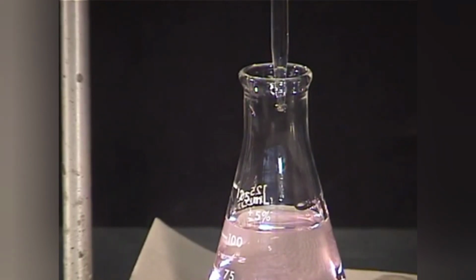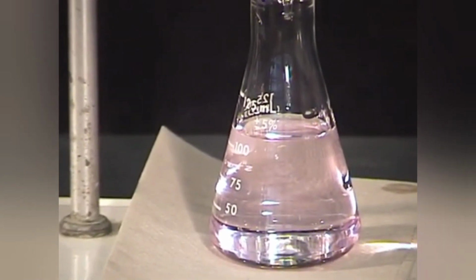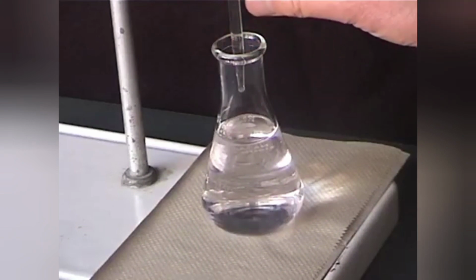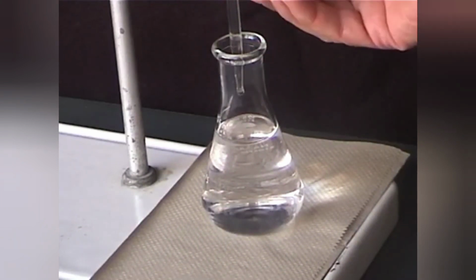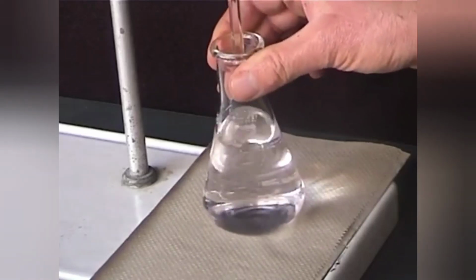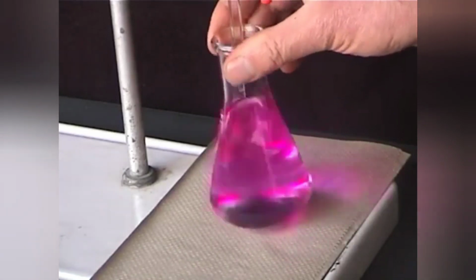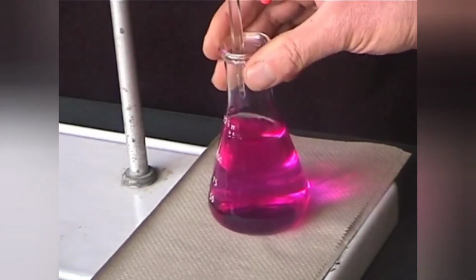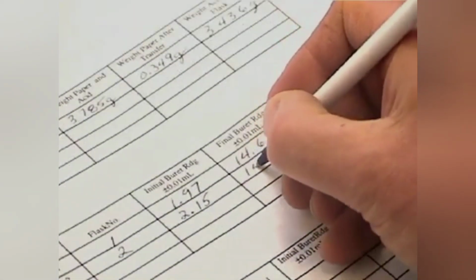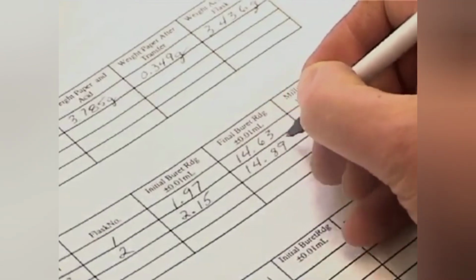You are looking for the one drop or split drop that causes the color to change for at least 10 to 15 seconds. If you are careless, however, perhaps working too quickly, you may overshoot the endpoint. In the case of this acid-base titration with the indicator phenolphthalein, the bright pink color shows that this has happened and that this trial must be done over. For good trials, be certain to record your final burette reading directly into your lab manual.